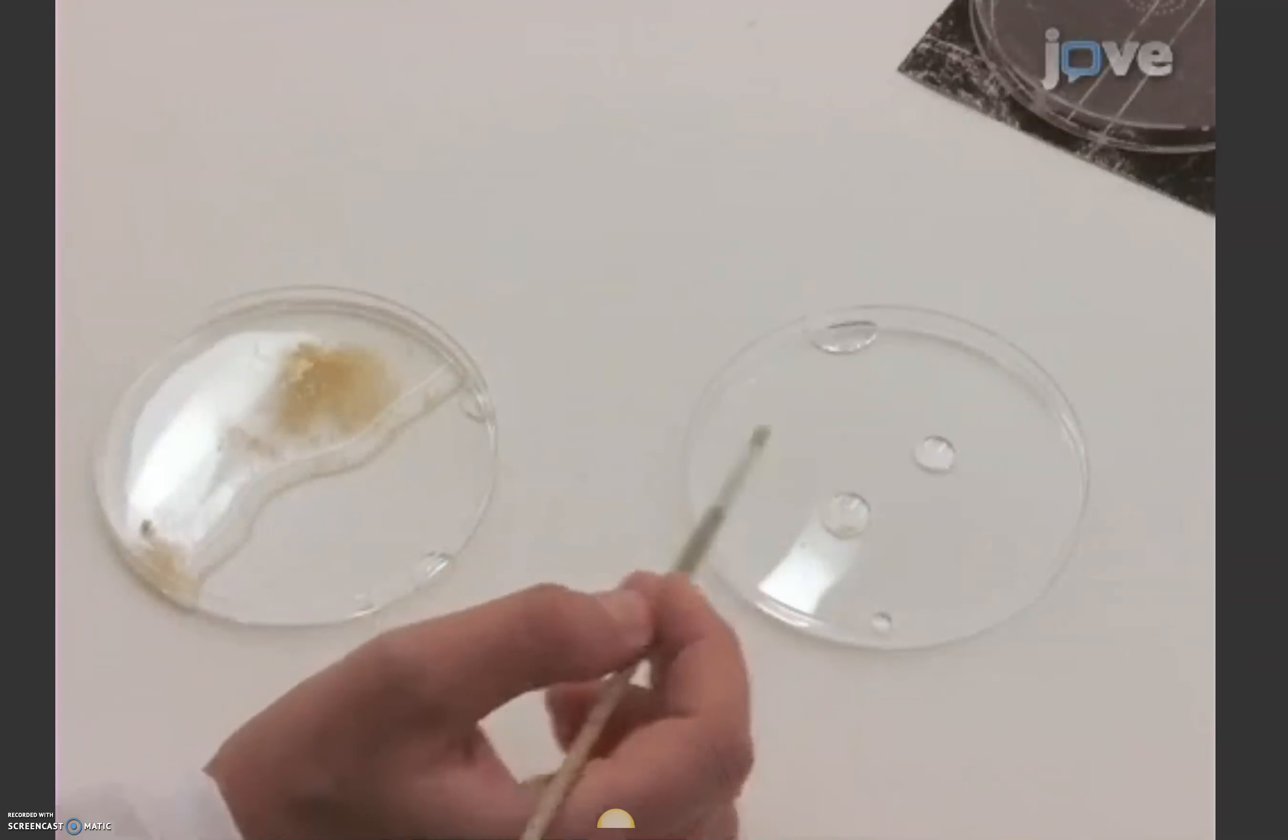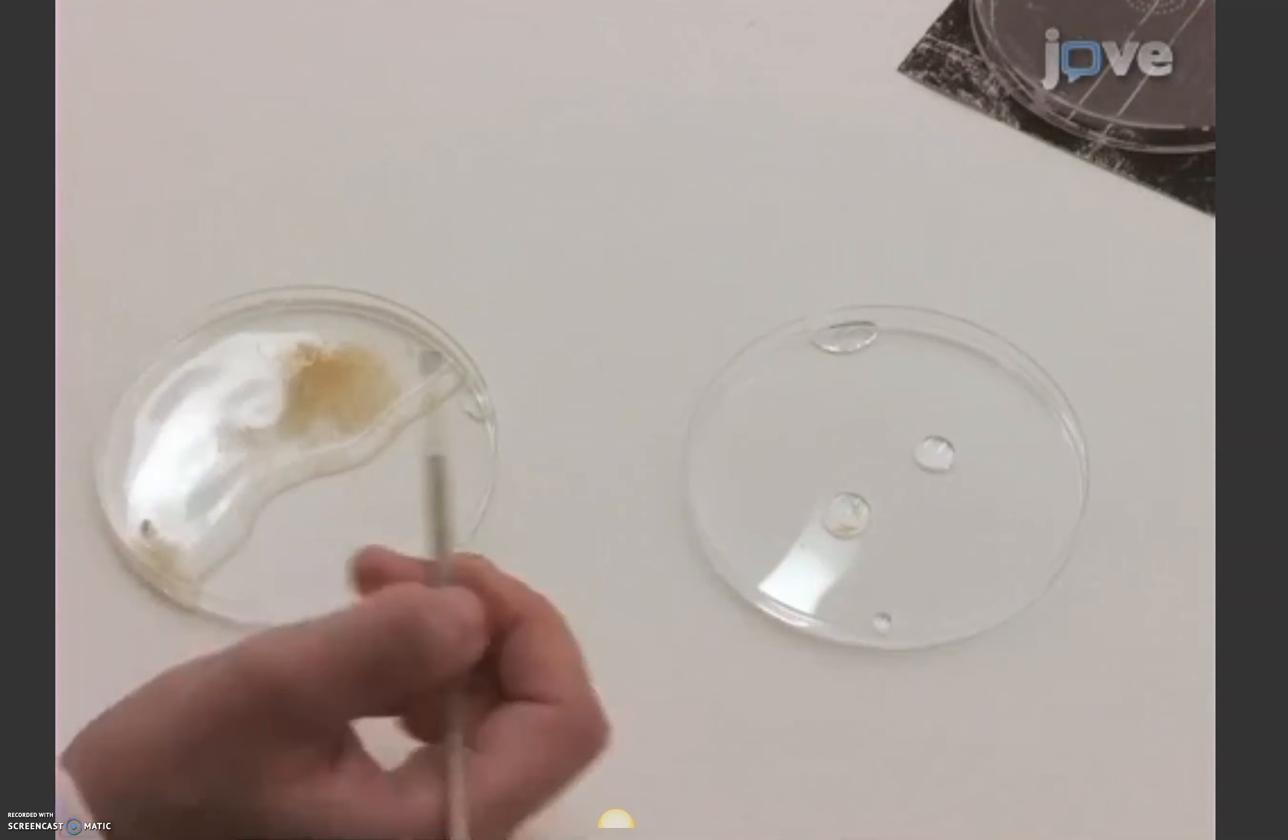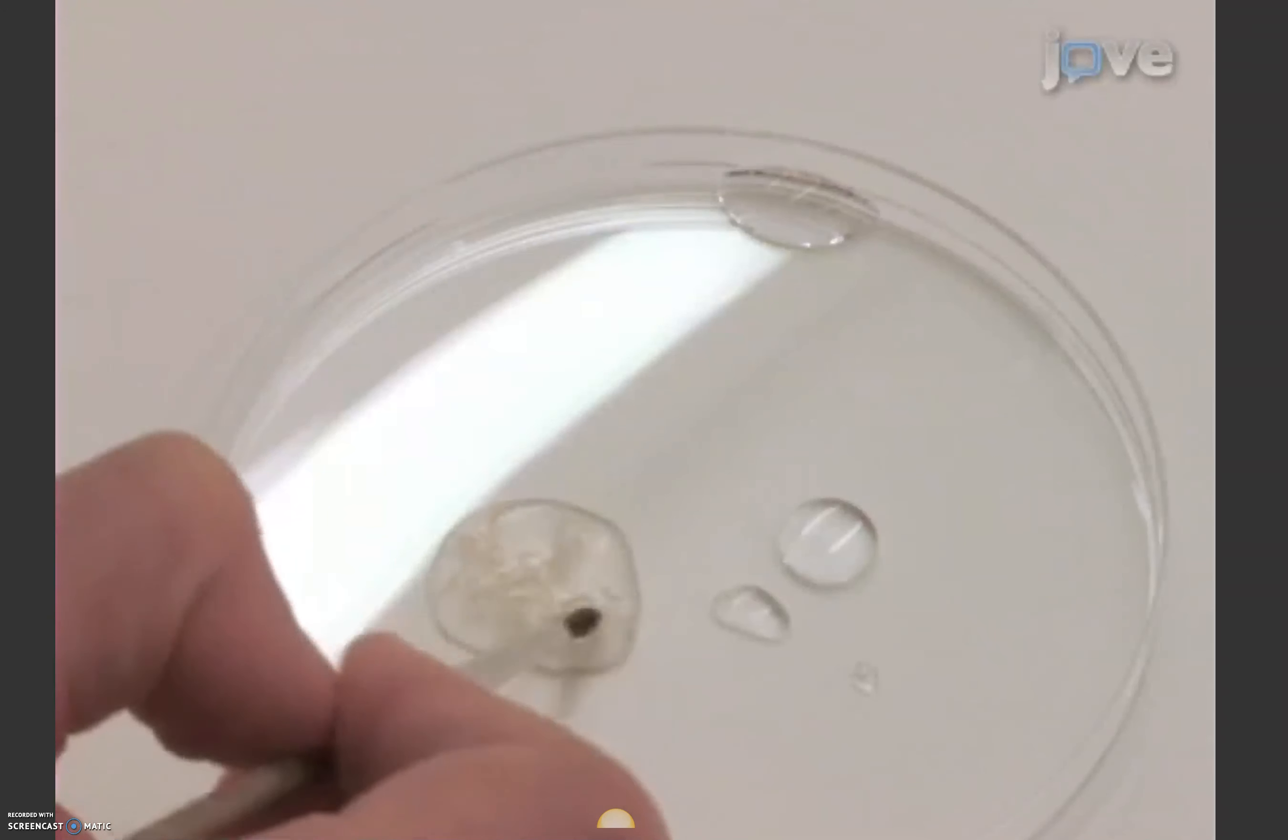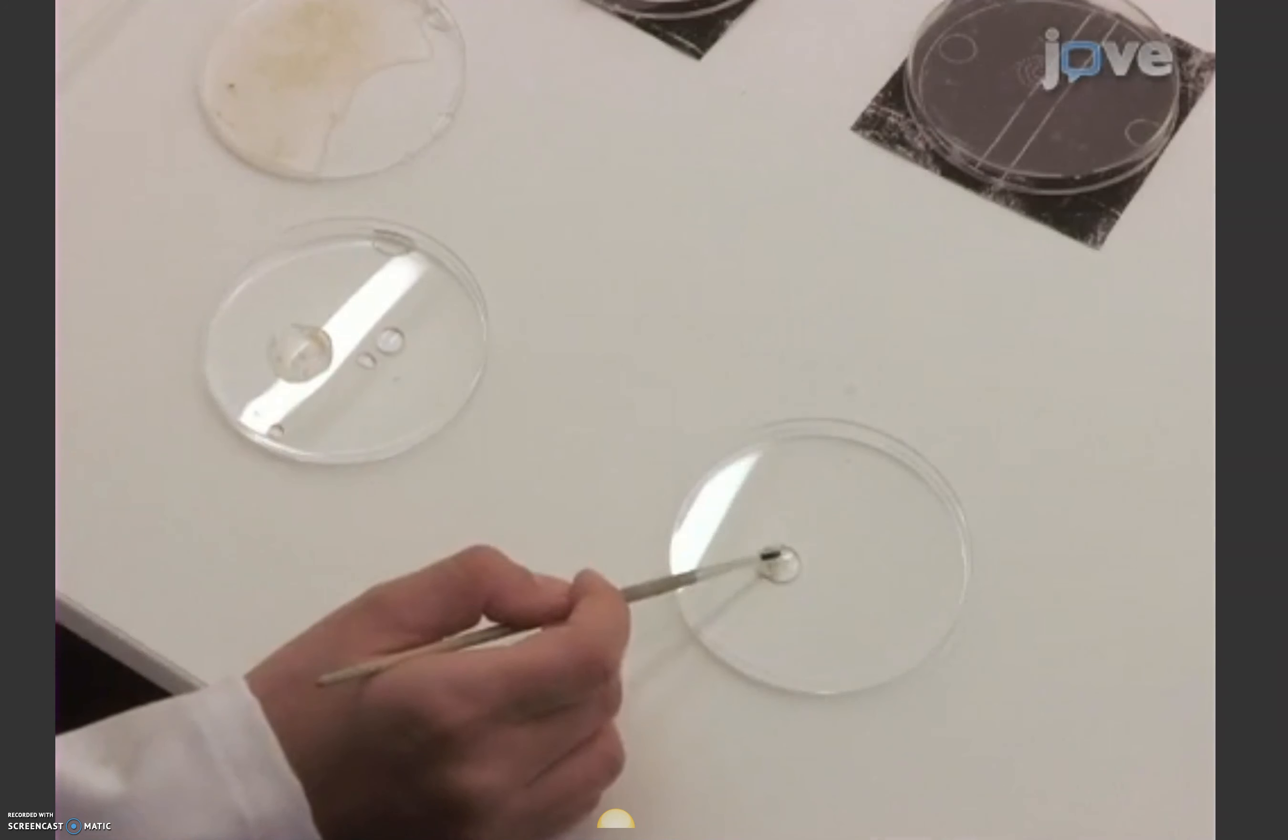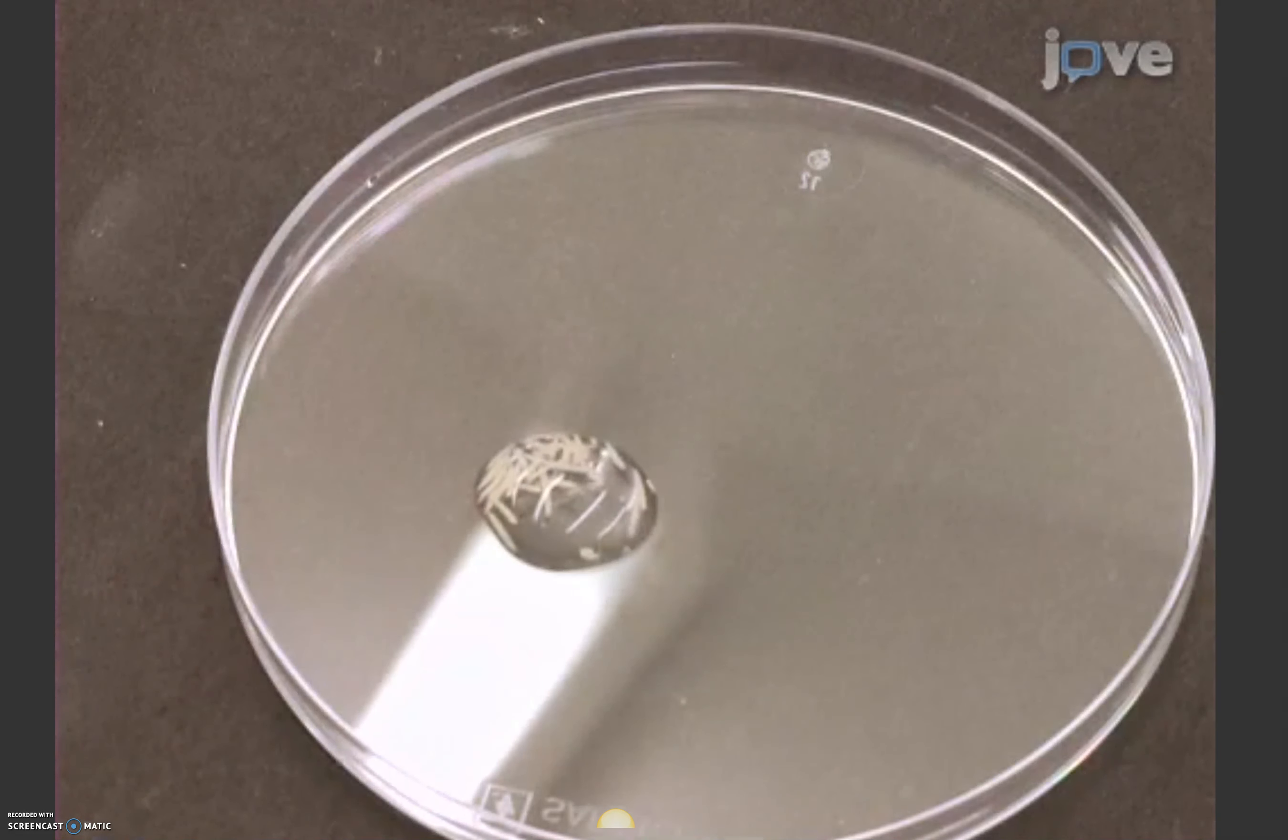Transfer the larvae to a petri dish that contains a few drops of tap water, and carefully move them forwards and backwards with a brush. Then, transfer the larvae to a second petri dish that also contains some drops of tap water. There, inspect the larvae for food paste on their body walls.